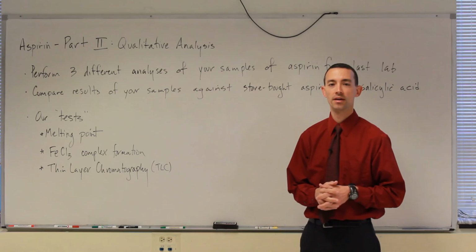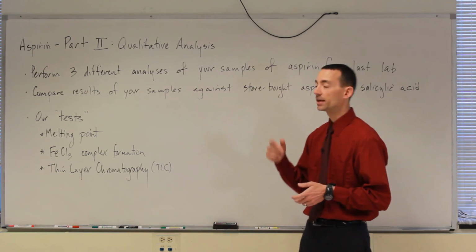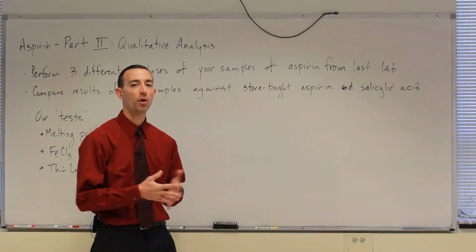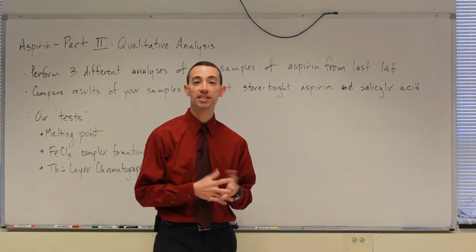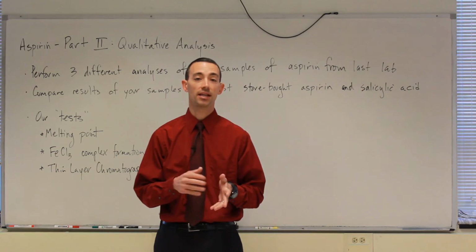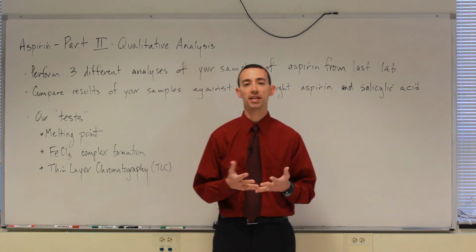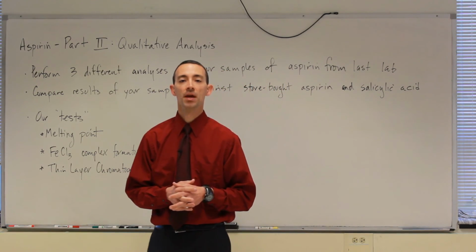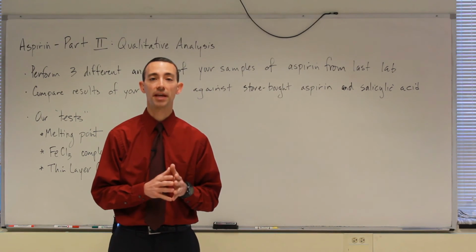This week we're discussing the Aspirin Part 2 Qualitative Analysis Experiment. This experiment obviously follows up on what we did last week when we created a sample of acetylsalicylic acid, or aspirin, beginning with salicylic acid. So today we want to begin to investigate our sample, or rather samples if you recall, from last week. Because when we left the lab last time, you should have had two samples.